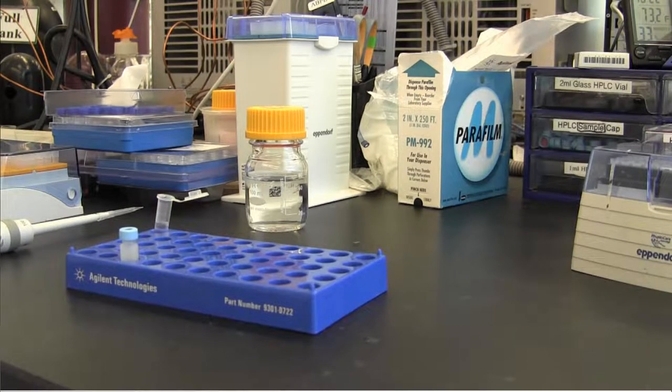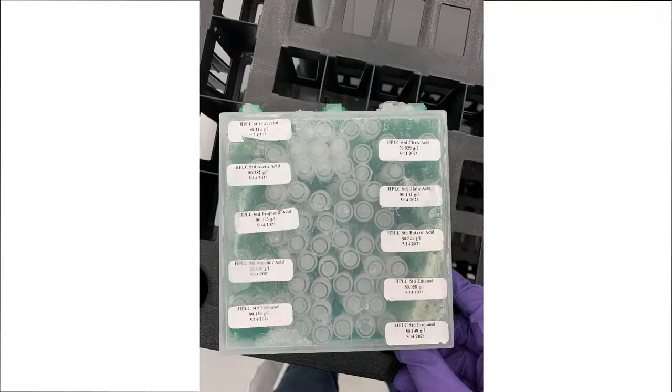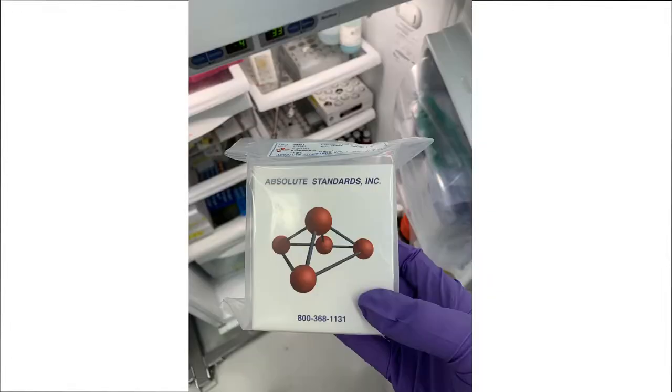For calibration standards, prepare the first standard using 80 gram per liter stock from the analytical freezer. Prepare at least 5 calibration standards using serial dilution to allow the range to cover the estimated concentration of unknown samples. QC standards are used as absolute standards for cross-checking all carbohydrates, alcohols, and organic acids. Their concentration is 1 gram per liter.